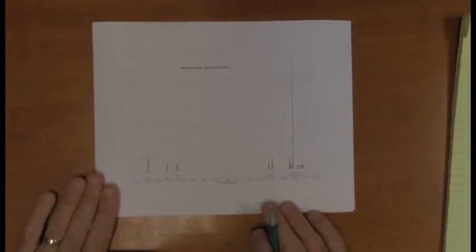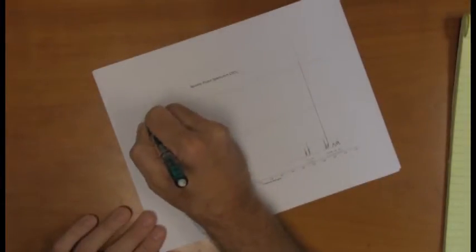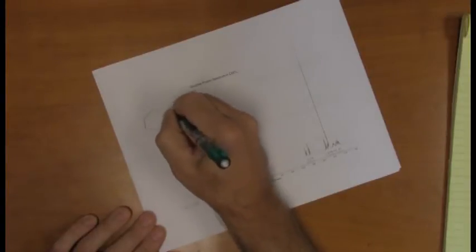Now we're going to change perspective here for a moment, because I want to show you how I go about doing this type of thing. It's going to be a mess down here. You're going to see my hands, but at least you won't have to see me. What I think the first thing you ought to do when you have your structure drawn is redraw that structure on every single one of the spectra. So I would take all of them and redraw it and put your numbering scheme on it. Okay.